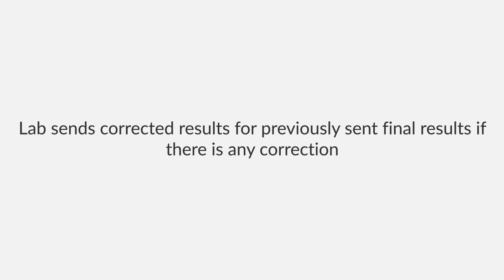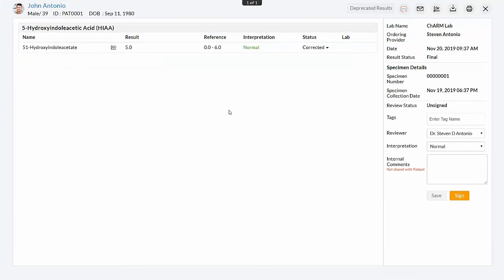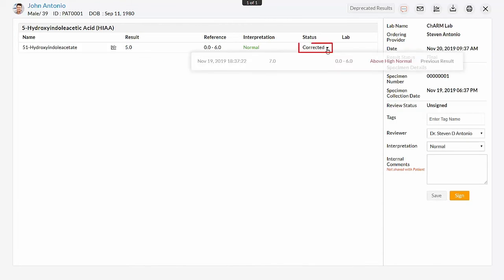In some scenarios, lab can send corrected results for a previously sent final result. The process of reviewing the corrected result received will be the same as that of other results. Here, the status will be changed to corrected instead of final. Clicking the corrected result will show both the previous result.